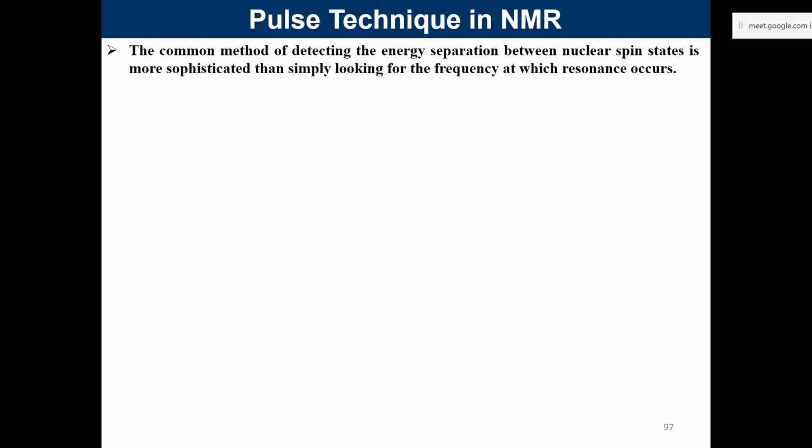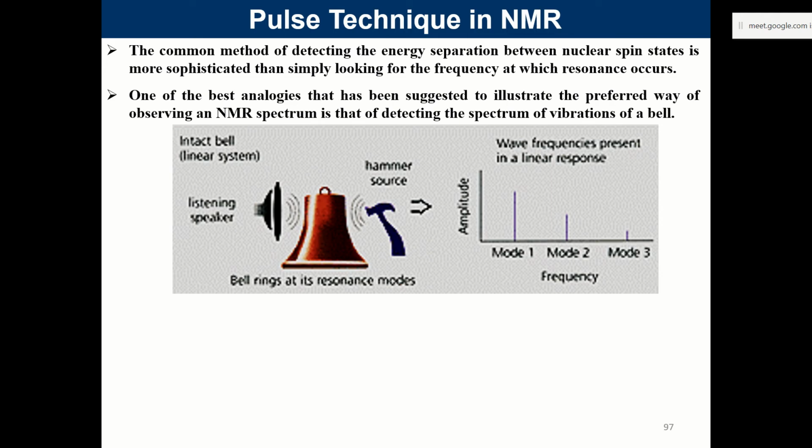Day before yesterday, we started learning about the pulse technique in the NMR. And I told you initially, to understand this concept, we can take the analogy of a hammer striking the bell. So that kind of thing we imagined.